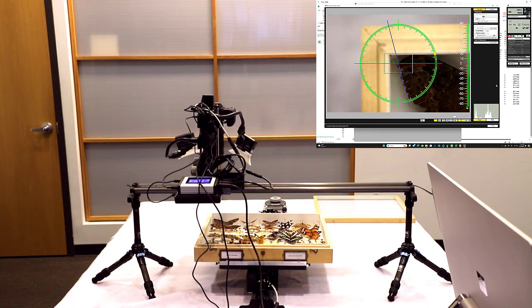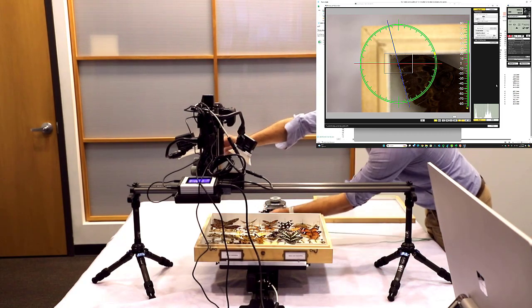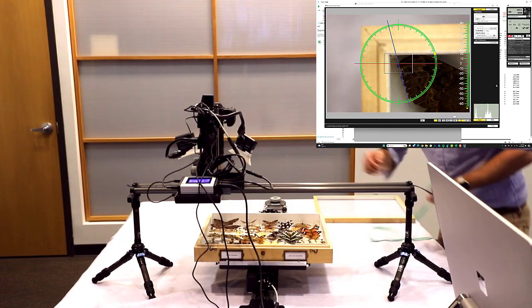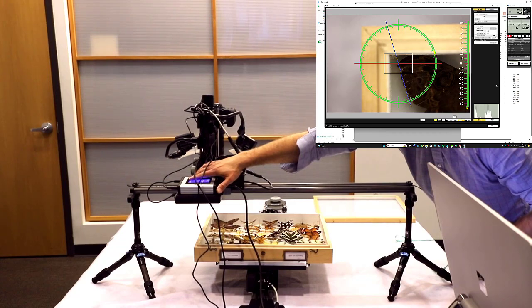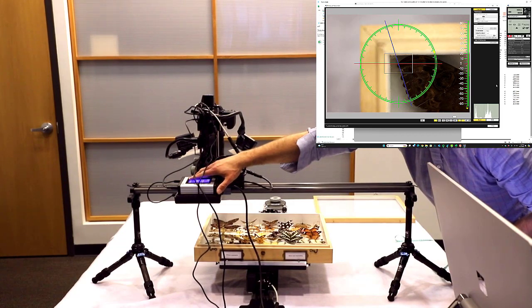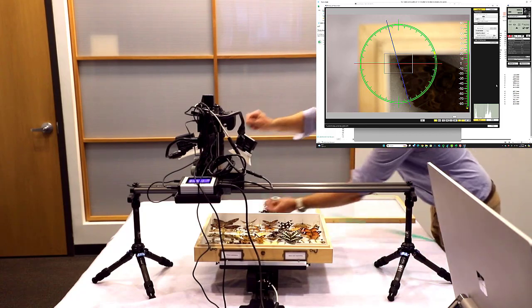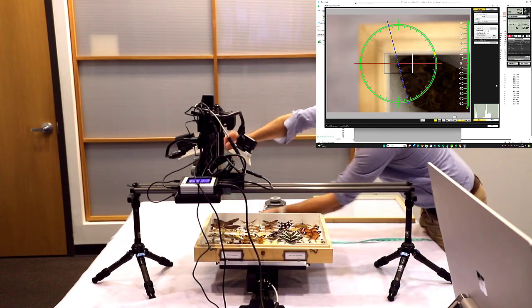Now remember, I said I also want our field of view to be tied to the 25 centimeter mark. So now I'm going to take the measuring rule, which is included, and measure out where we are. Right now we're closer to about 28, so the camera needs to come down a little bit. I'm just going to drive the x-axis down about 2 to 3 centimeters. Right there, that's going to be at our 25 centimeter mark. Yep, almost perfectly.